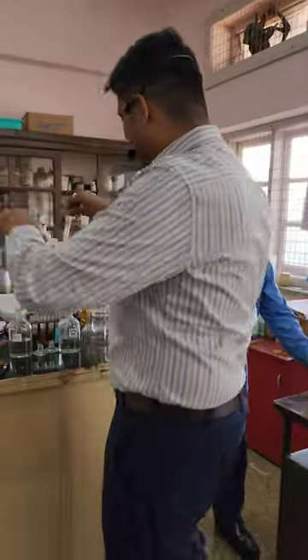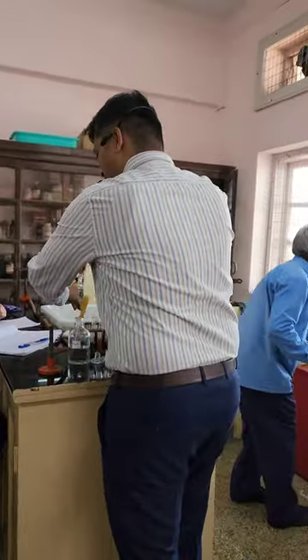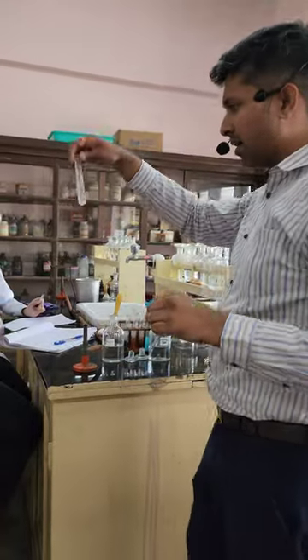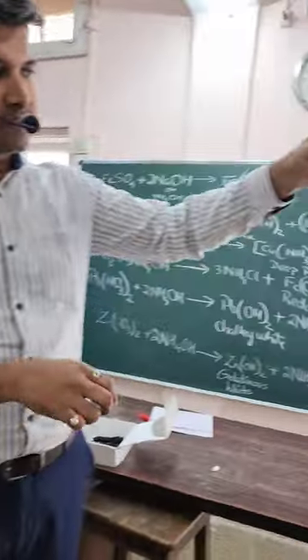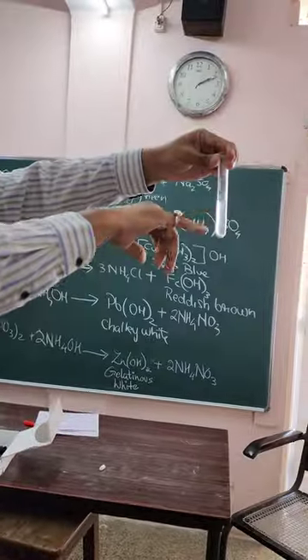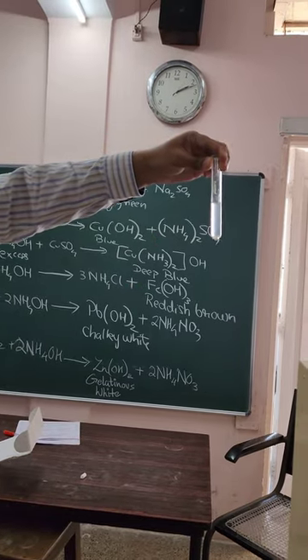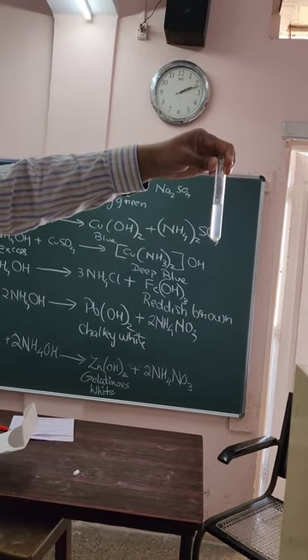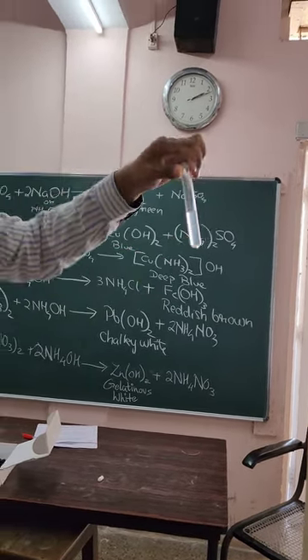More gelatinous white you will be able to see with NaOH. With NaOH, you can see the PPT is still developing and it is a lighter, transparent PPT — translucent, you can see.